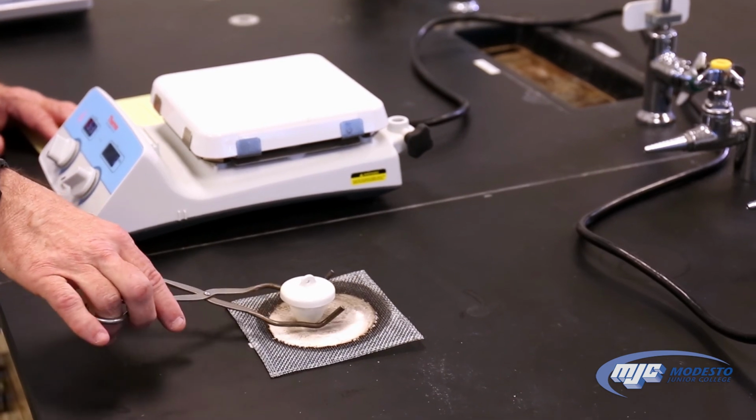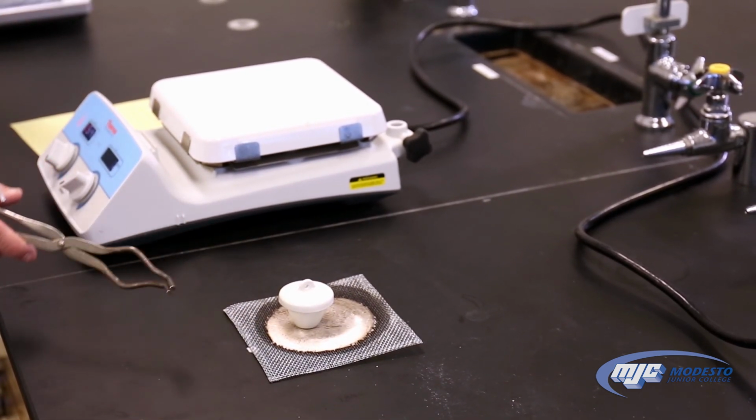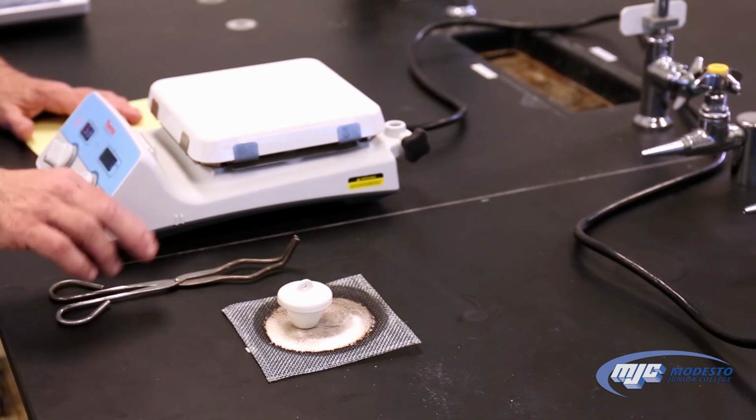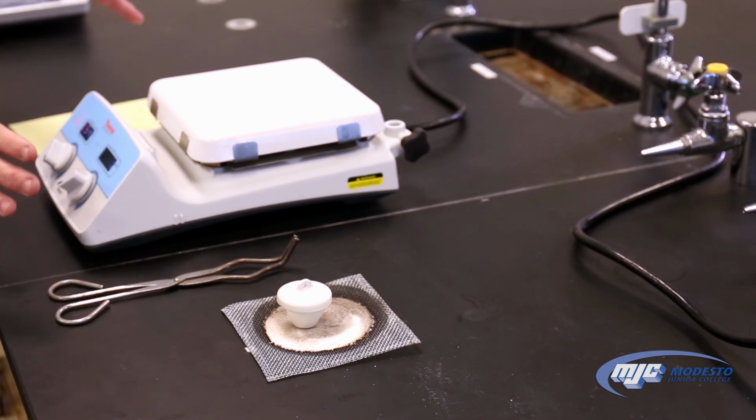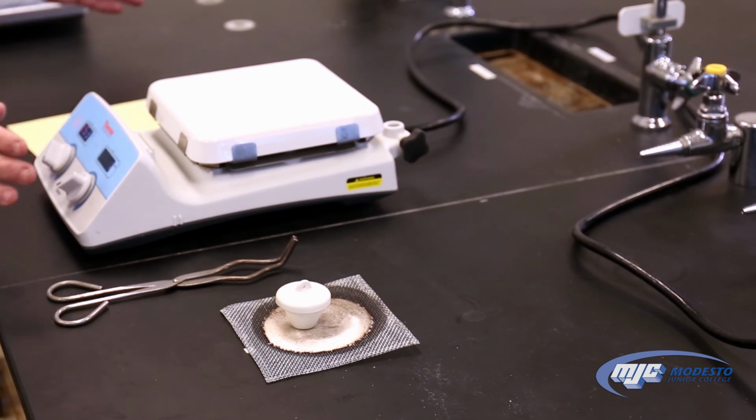We don't want to set it right on the countertop because sometimes that's kind of cool and that's really hot and it'll crack the crucible. So now we're going to just let that sit and become cool enough so that we can touch it without hurting ourselves. Then we're going to weigh it.